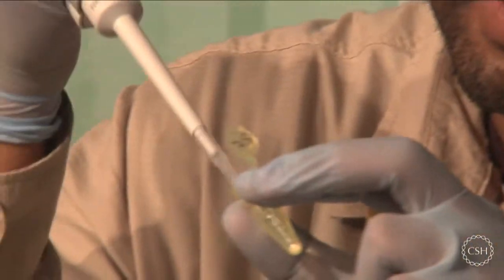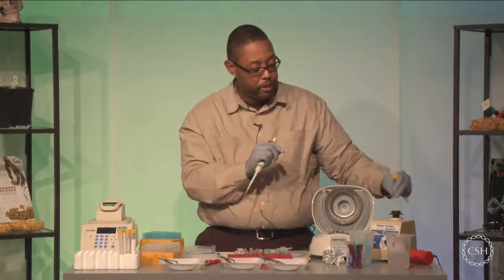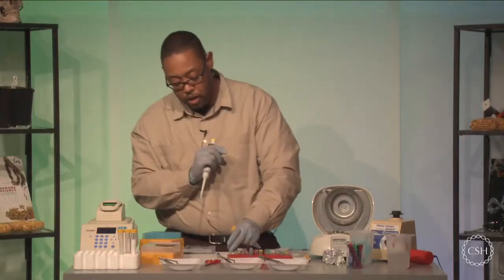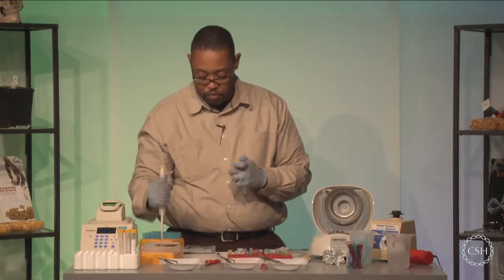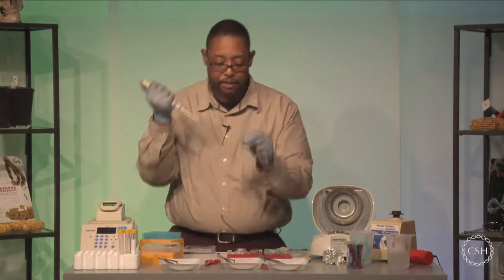Now, once you can see that it's back into solution, you can either finger vortex to make sure you're getting good mixing, or you can go back to your vortexer itself to ensure proper mixing. I'm going to place that down, eject off my tip and move to the next test tube. I'm going to draw another 100 microliters of my distilled water, and add that to the next test tube.